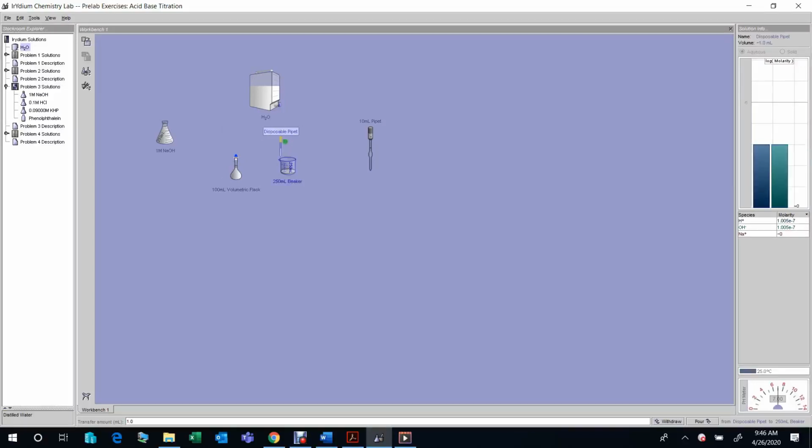Withdraw. 1.0. Pour. 1.0. Withdraw. 1.0. Pour. 1.0. Withdraw.